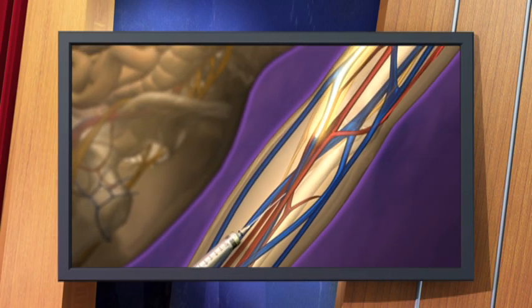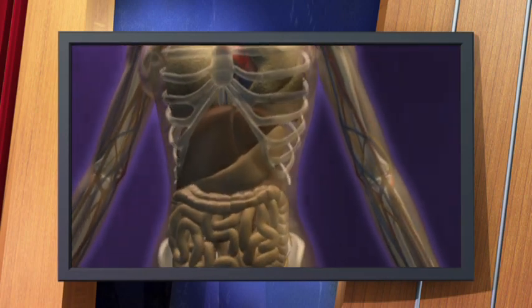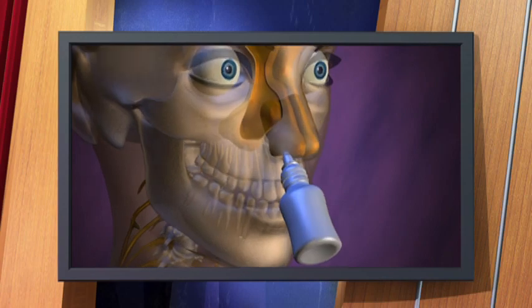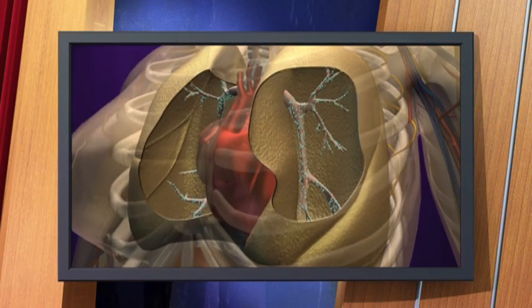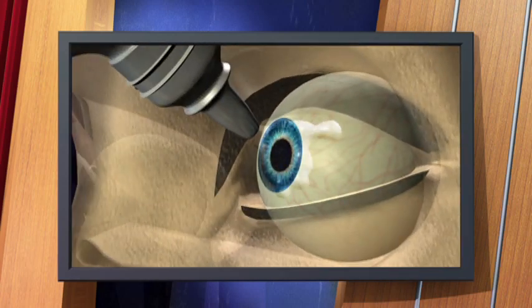When compounds bypass the body's natural filter mechanisms and enter the bloodstream directly, preparation requires sterile or aseptic compounding techniques. Some routes of administration requiring aseptic preparation would be intranasal, inhalation, injectables, and ophthalmic preparations.